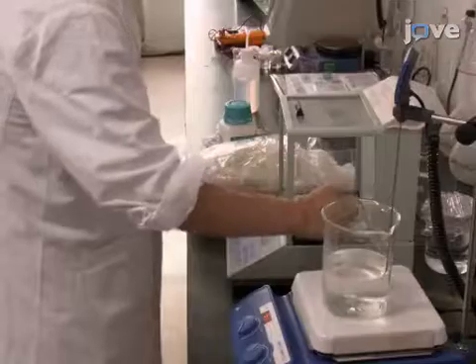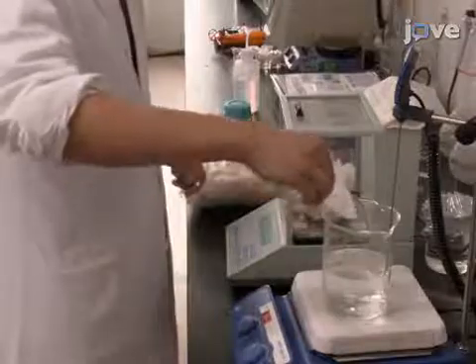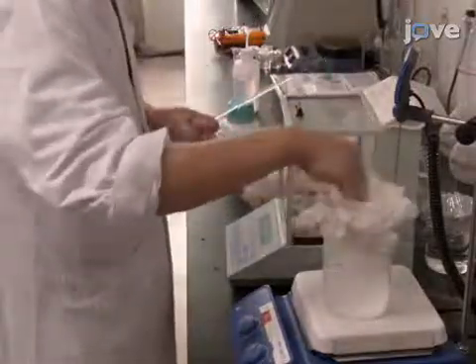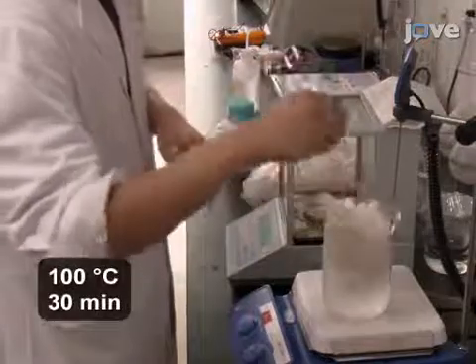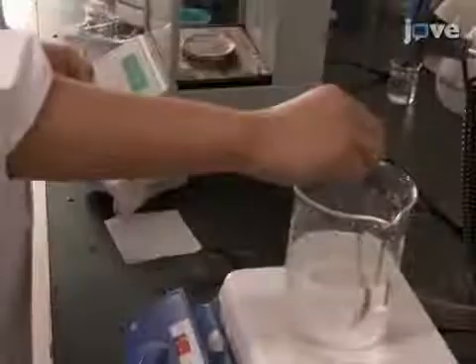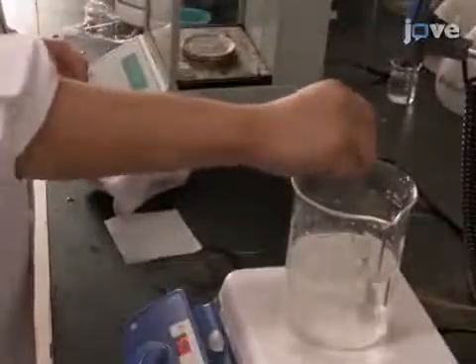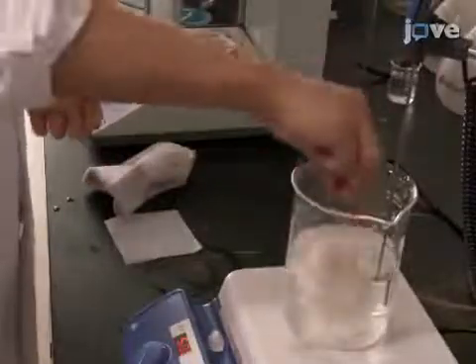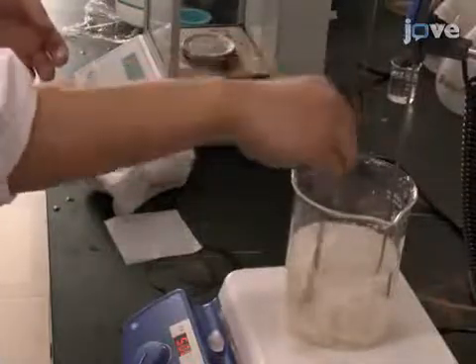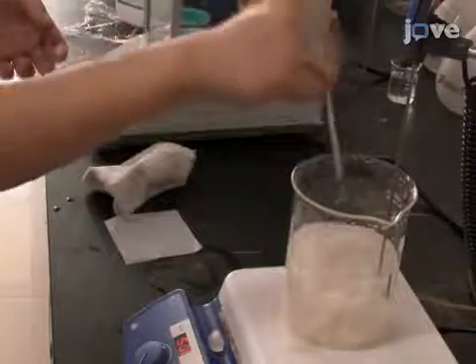Start by degumming the Bombyx mori cocoons in an aqueous solution containing 0.5% sodium carbonate. Incubate the submerged cocoons at 100 degrees Celsius for 30 minutes. Then replace the sodium carbonate solution and repeat the incubation a second time. When finished, wash the silk with deionized water to remove the sericin.